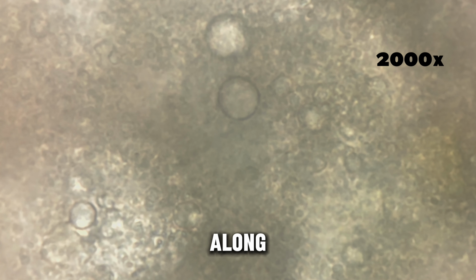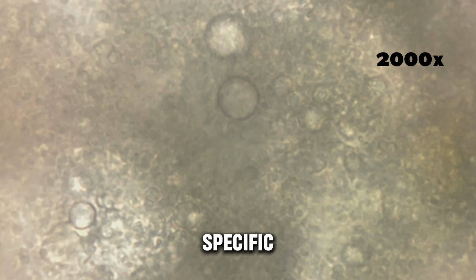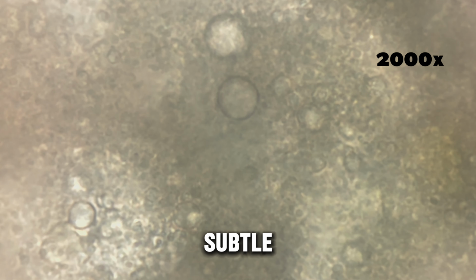The background is crowded with microscopic debris. Very little empty space remains visible. Every part of the image is filled with detail. Rounded particles gather along sharper edges. They follow contours and collect in specific regions. This repetition creates subtle patterns across the field of view.